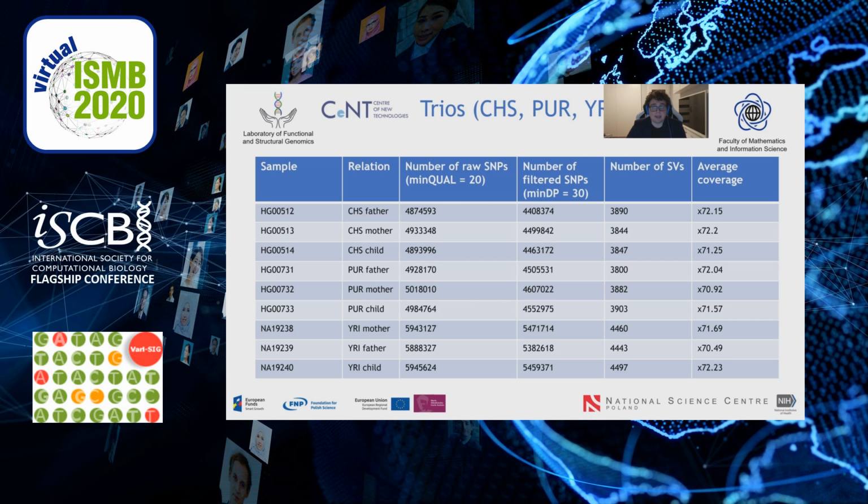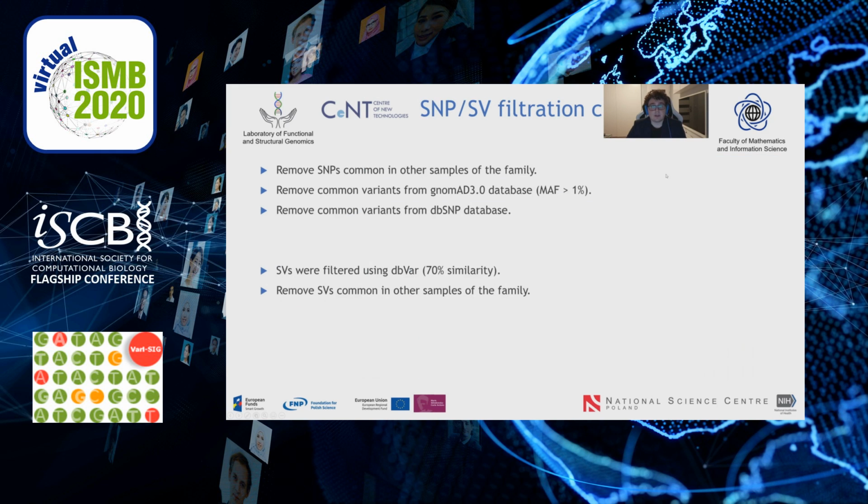Some results which we obtained using our tools, as you can see, we ran ConsensuSV on samples from the 1000 Genomes Project, and those are the SVs that were obtained after running them through our tool. And then we actually used the functional analyzer for the filtering.